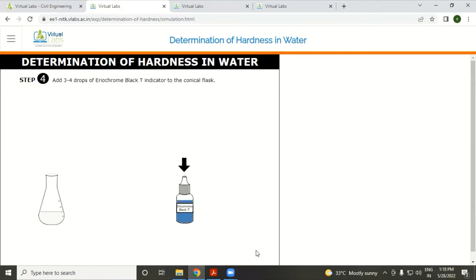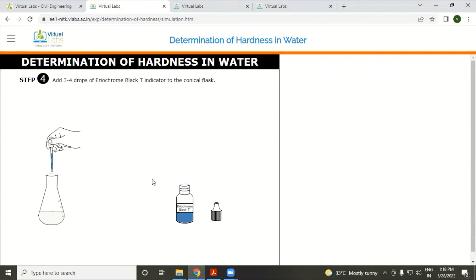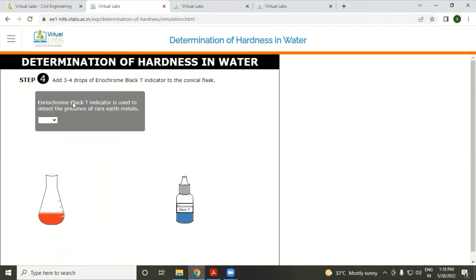Add three to four drops of Eriochrome Black T indicator. Eriochrome Black T is used to detect the presence of alkaline earth metals.